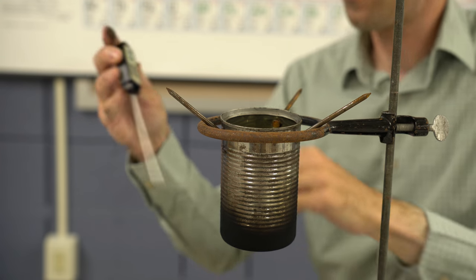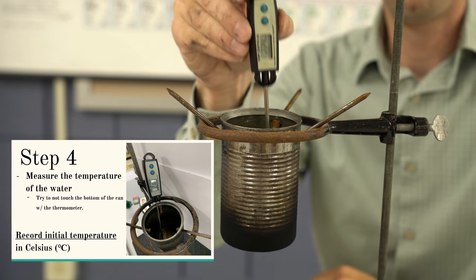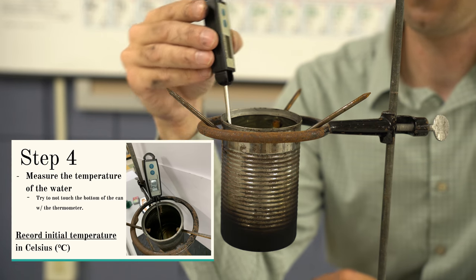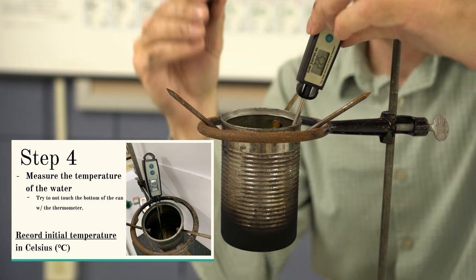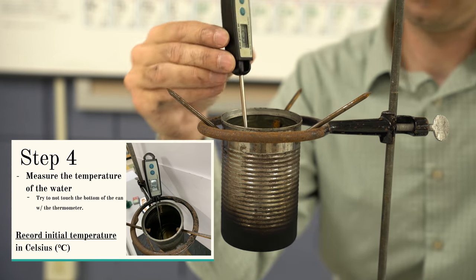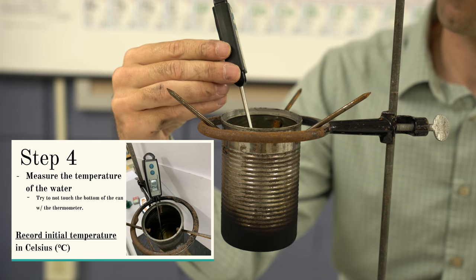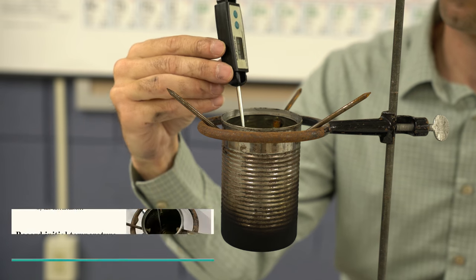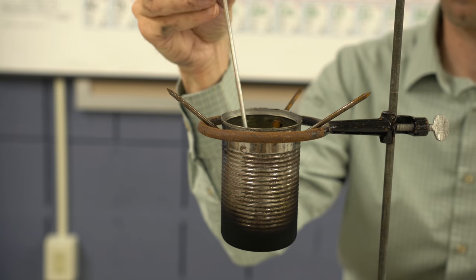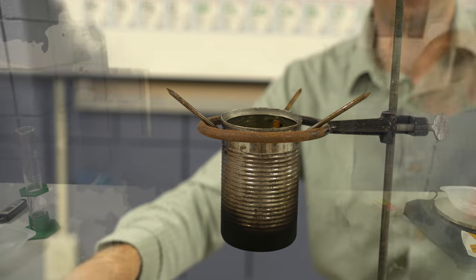Now that we've just added the water to our can, we're going to take our thermometer, making sure not to keep it at the bottom of the can to make sure we're getting the temperature of only the water there. So put it at the bottom and just raise it up just a little bit. And then we're going to take a reading. In this case, our reading is right around 22.4 degrees Celsius. So 22.4 degrees Celsius, that'll be our reading there.